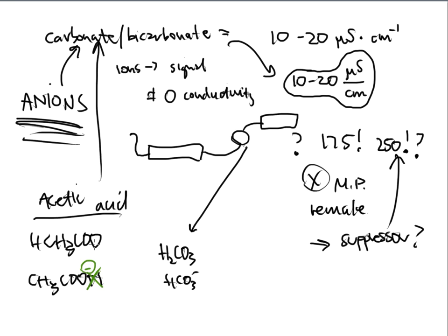We've thrown in another ion. This ion is a little bit bigger compared to the bicarbonate ion, and maybe I can get separation to happen a little bit better on my chromatogram. So it just aids in the separation. Sometimes it's needed, sometimes it's not. It really just depends on the standard operating procedure that you're following. So just follow the method, and if it does say add acetic acid, not a big issue at all.